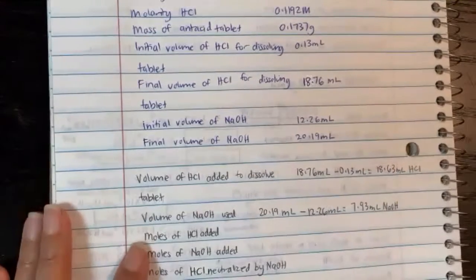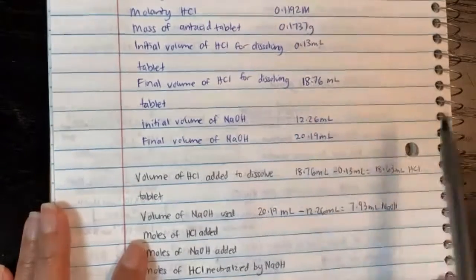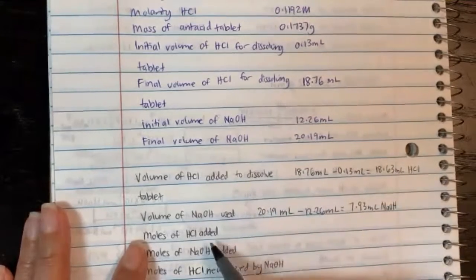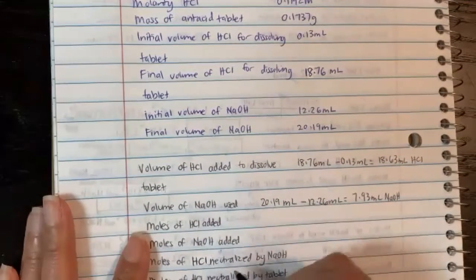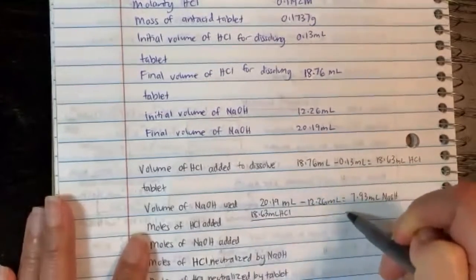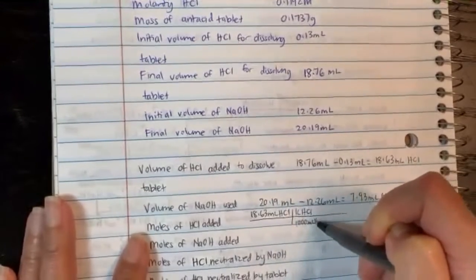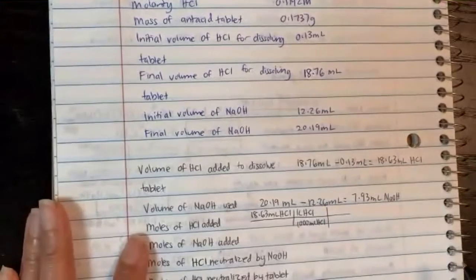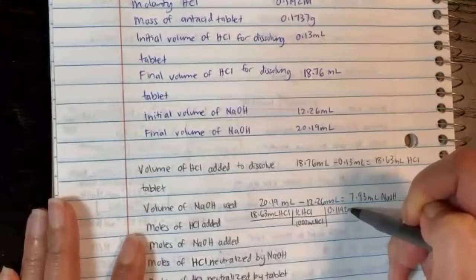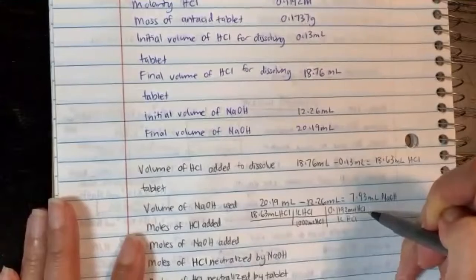Now, can we get the moles of hydrochloric acid? Yes, because we have the molarity of hydrochloric acid up here. All we do is convert this to liters, which is divided by 1,000. So let me go ahead and put the calculation down to get moles of HCl. You take 18.63 milliliters of HCl, and we know that 1 liter of HCl contains 1,000 milliliters of HCl. This is where you divide it by 1,000. And then we will use that to multiply with the molarity, because it's 0.1192 moles of HCl in 1 liter of HCl solution. That's what the molarity stands for.